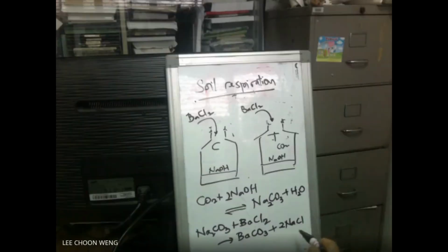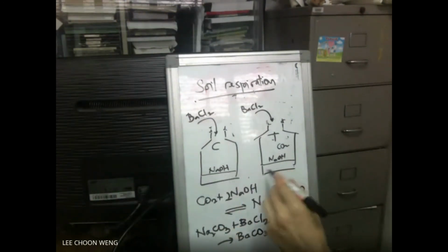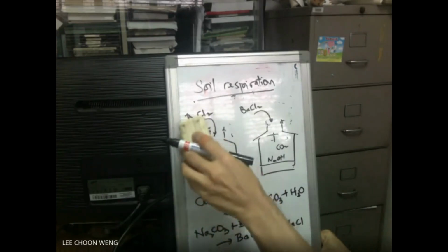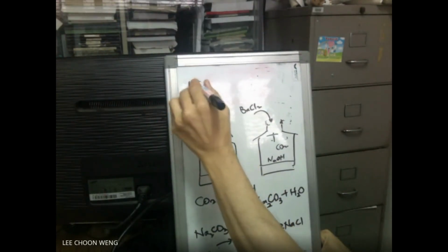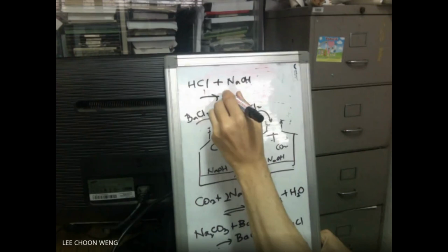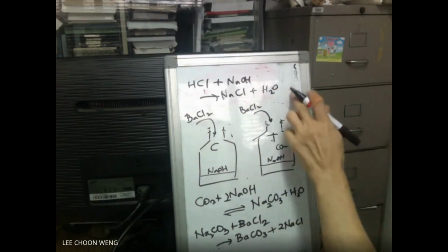So, what we are titrating is the leftover NaOH. So when we are titrating, okay, this is what we are titrating.